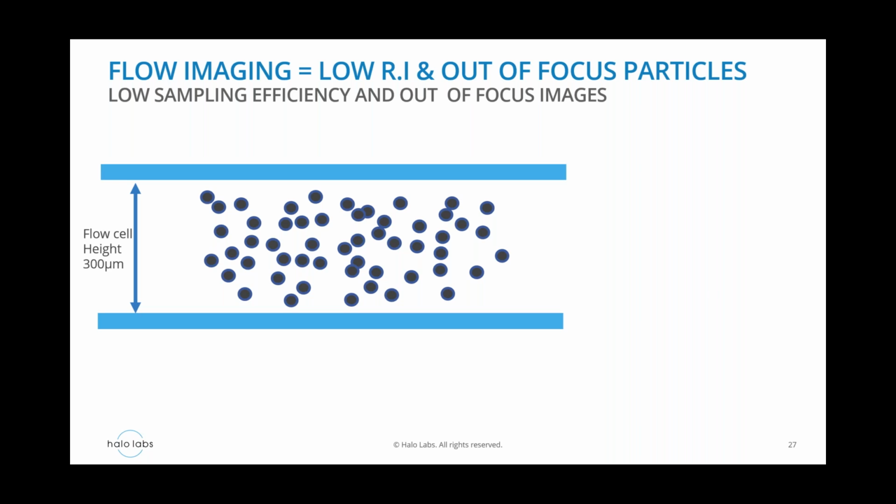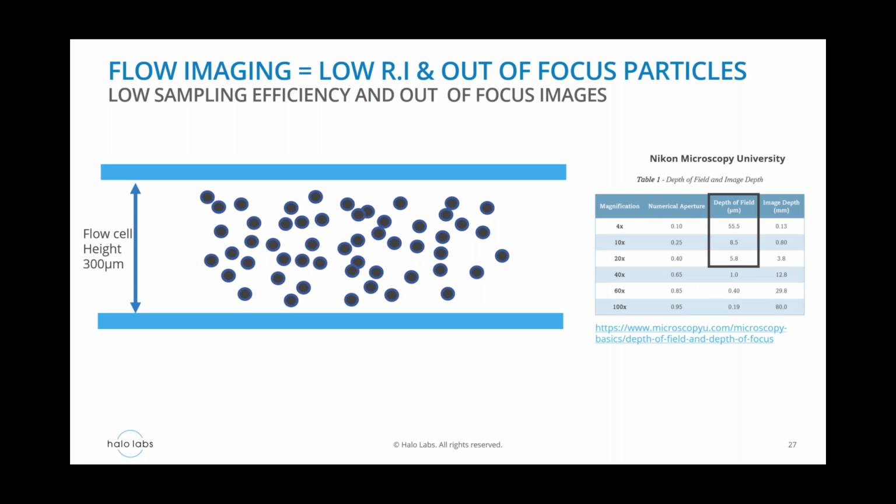The reason is that with flow imagers and even light obscurators, you have some sort of flow cell or capillary, and they tend to have a size range. The way optics works is that the particles that are going to be in focus are those in the beam waist, wherever there are the most photons. That's just a function of the objectives you use.